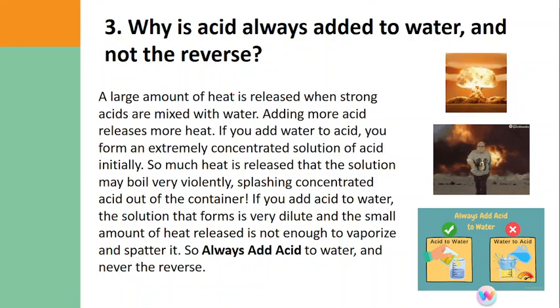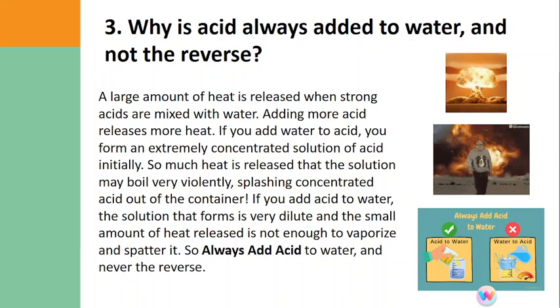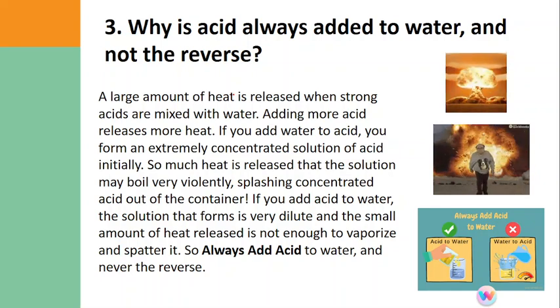So, if you have a spill in the laboratory or encounter a spill in the institution, hospital, or at home, and you do water to acid, it may cause an explosion or splashing, which is very dangerous to you.